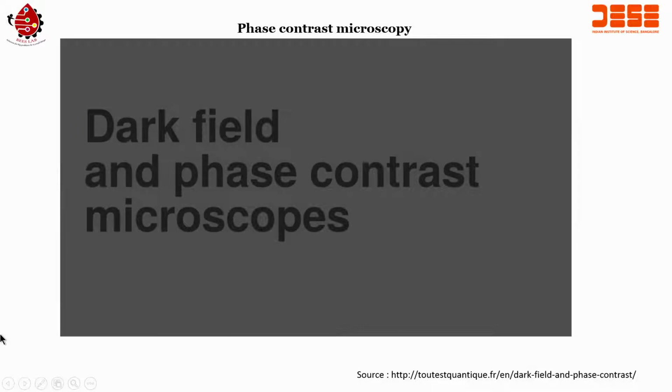Okay. So, phase contrast microscopy you have seen now, right. Now, there are several other microscopy where you can understand whether it is bright field or it is fluorescence, because in some cases we are staining with H&E and we are okay with bright field. If there is a DAPI and there is a Coomassie blue, or there is a red dye, or there is a green dye, which is FITC, and then there is a lot of other nomenclature given for these particular dyes, or names given for the dyes.